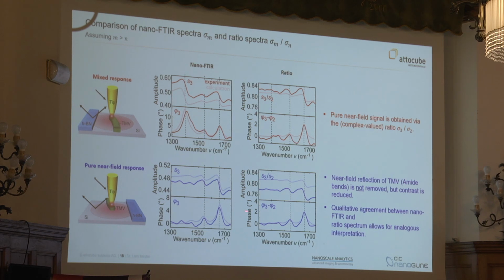Yes, but we also see, if you look at the scale, that before we had a signal on the order of 6 degrees, and now it's on the order of 2 degrees. So this is what we lose when we do this. We need much better signal to noise when doing this. Yeah.